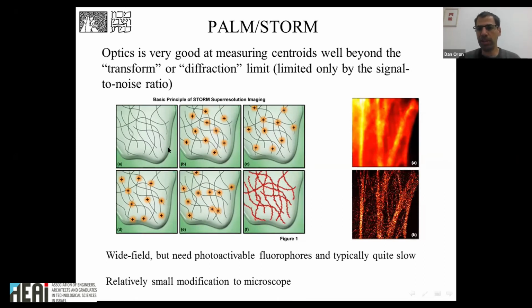If you repeat this maybe 10,000 times, you will have sampled almost all the fluorescent molecules in the sample. And now your image is just the X's, right? You marked an X, so the image is the positions of the X's within the noise. And so out of this, you get an image which is really nicely resolved. Typical resolutions achieved by this method can go as low as 20 or 30 nanometers.